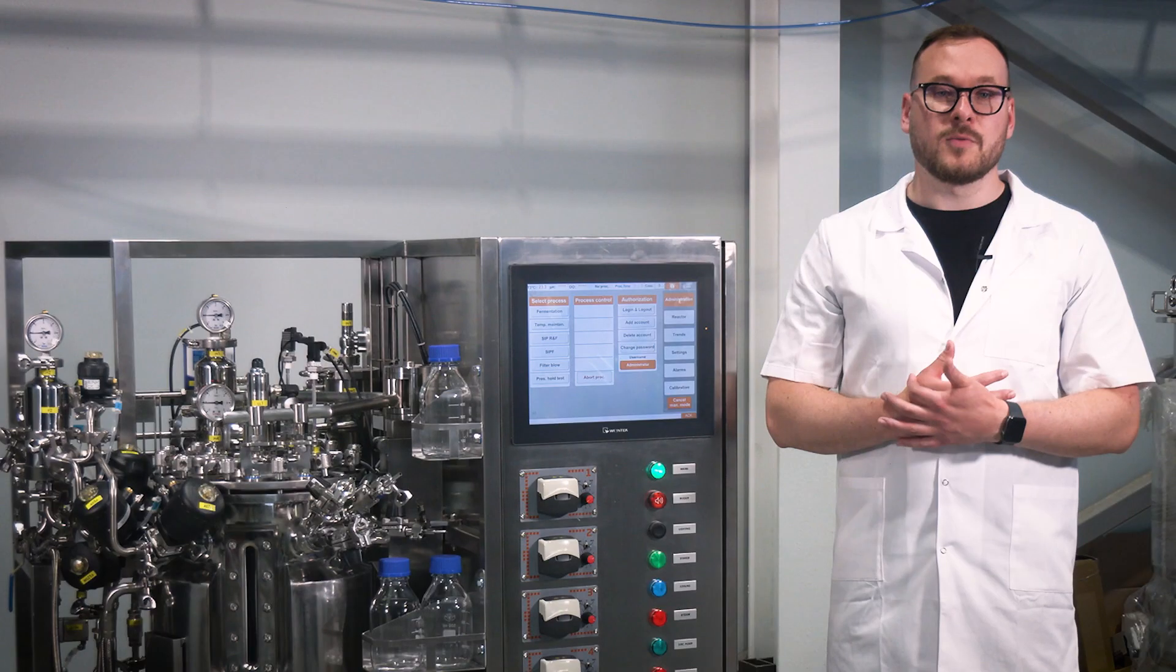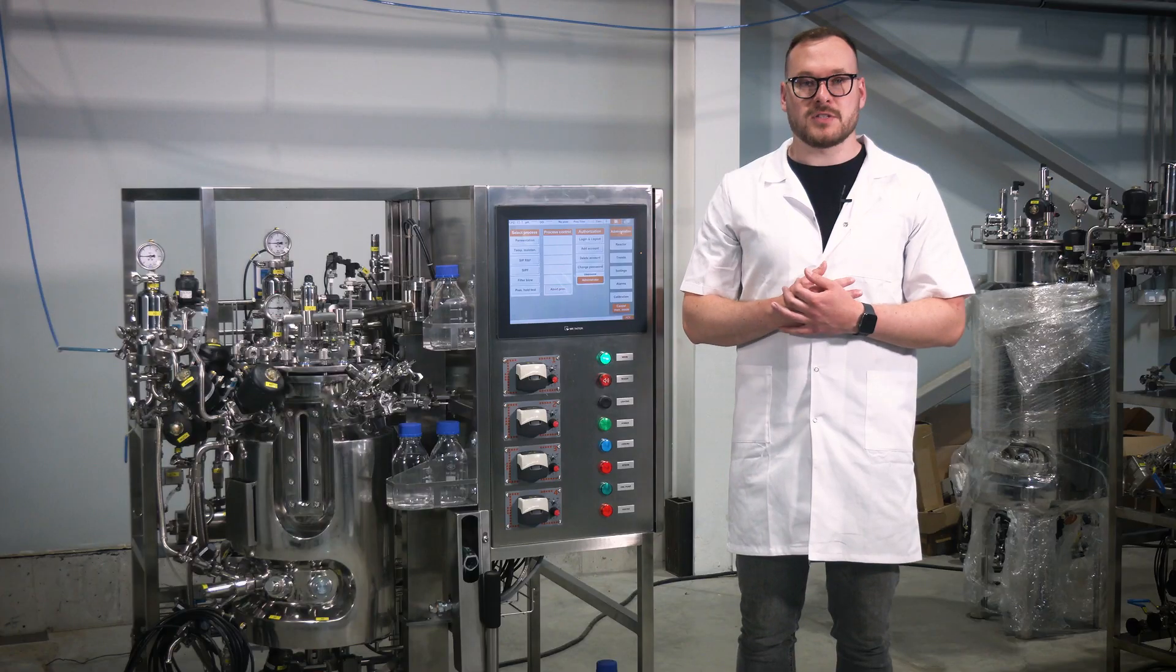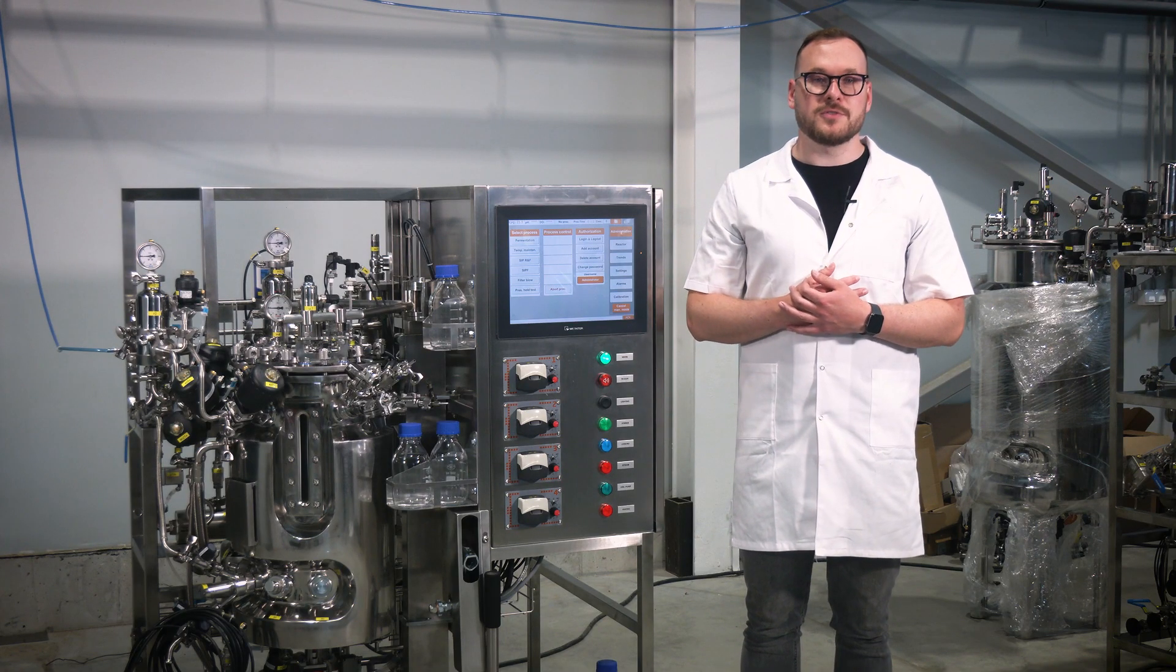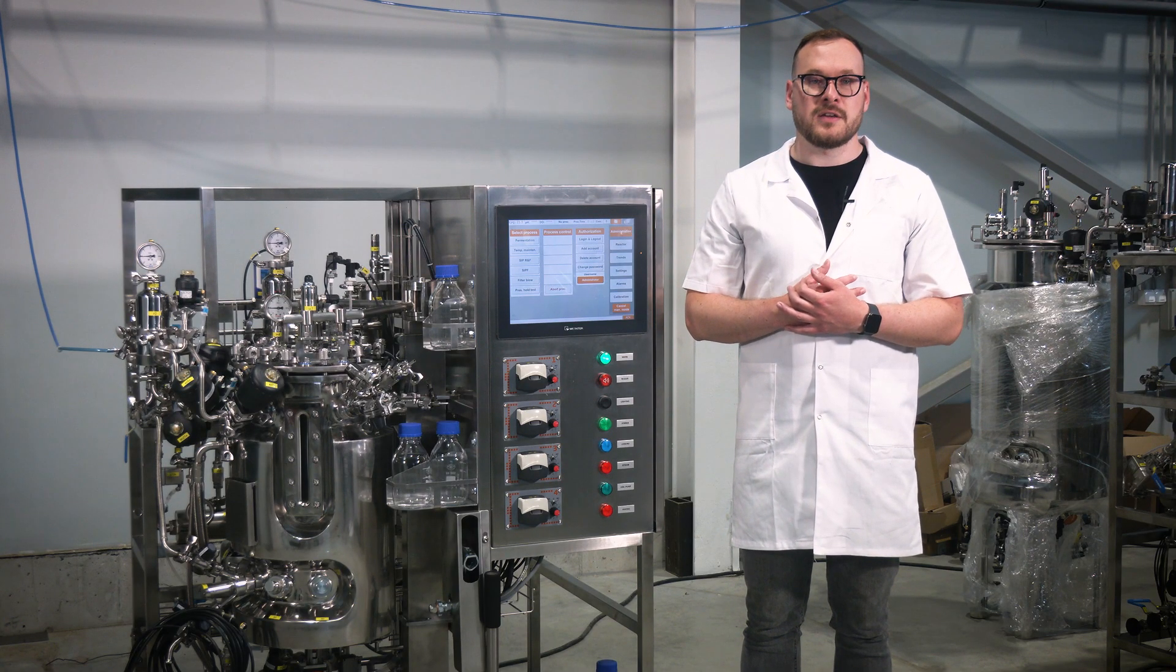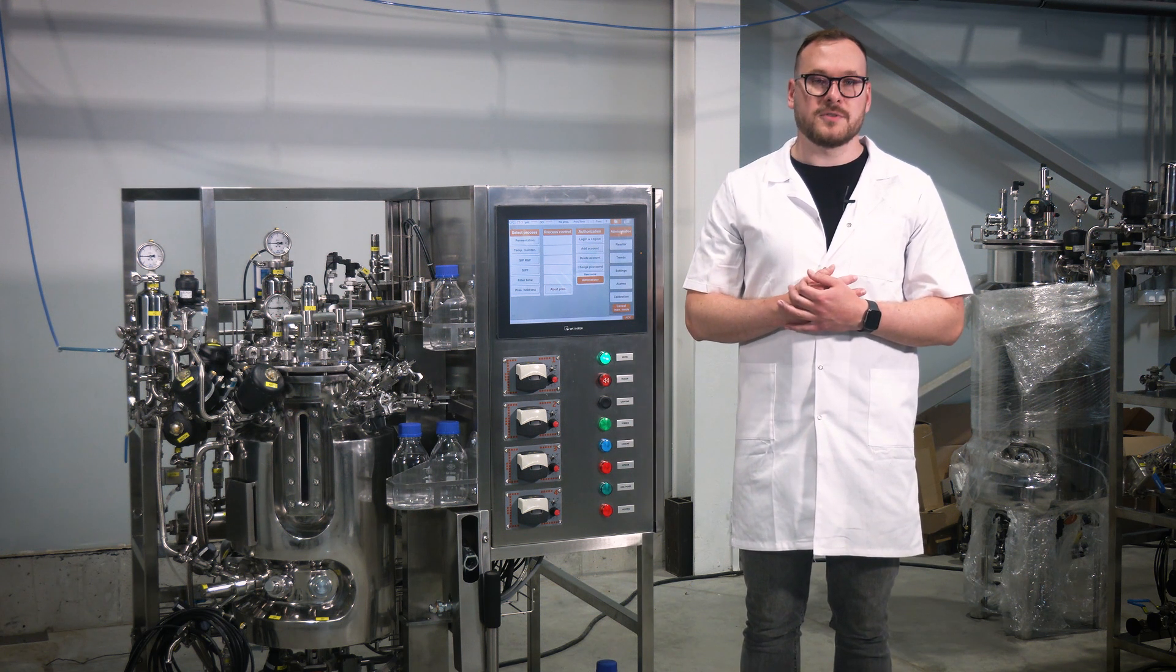The administrator access level grants the following options: All privileges of the operator and controller access levels, but also includes the creation of new user accounts, management of user passwords, deletion of user accounts.